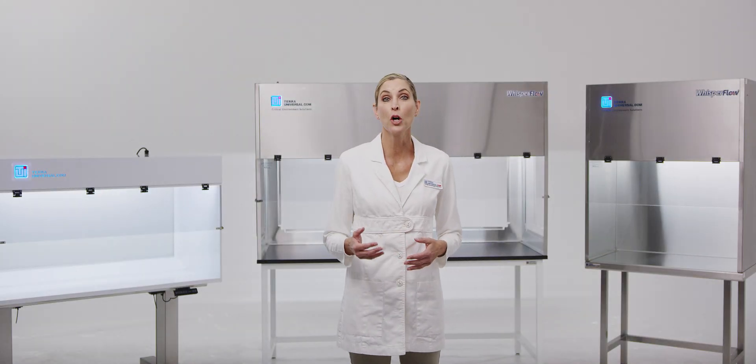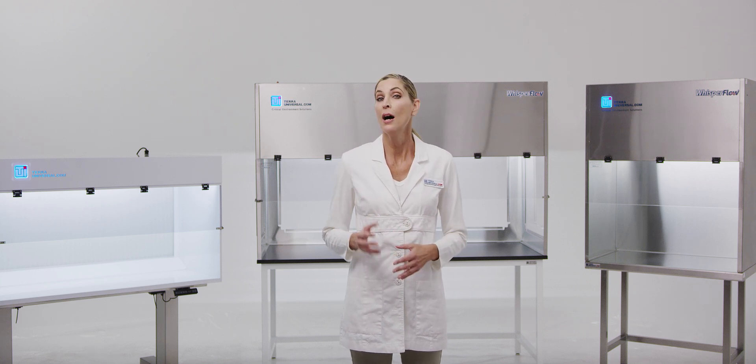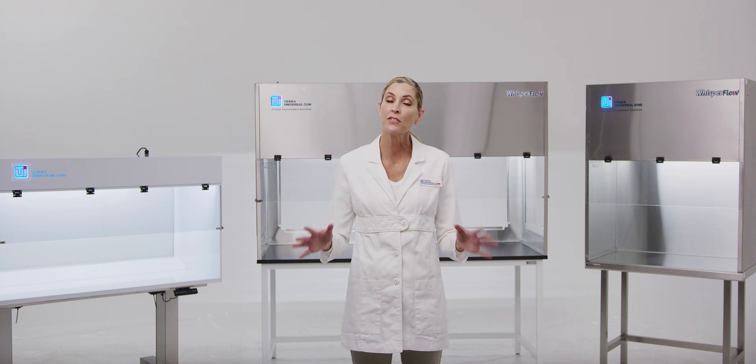Terra Universal's WhisperFlow Benchtop Laminar Flow Hoods prevent airborne contamination by supplying uniform unidirectional HEPA filtered airflow across the work area.